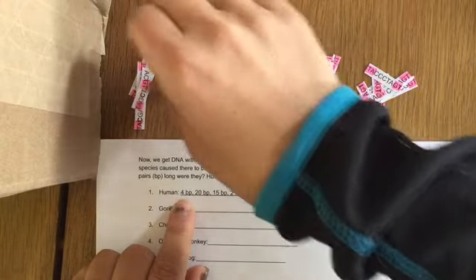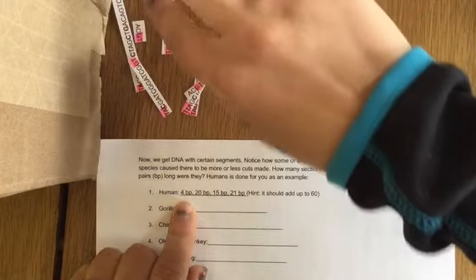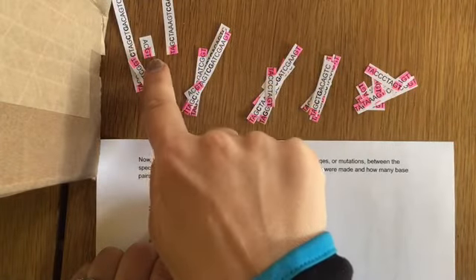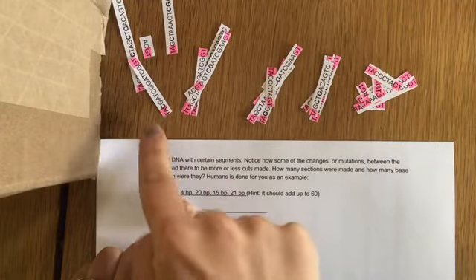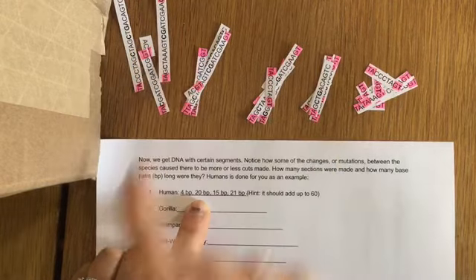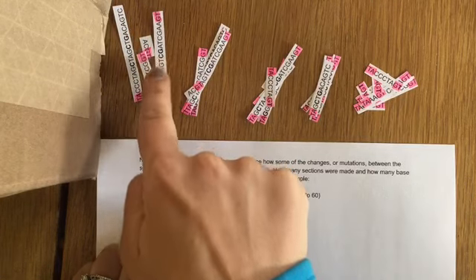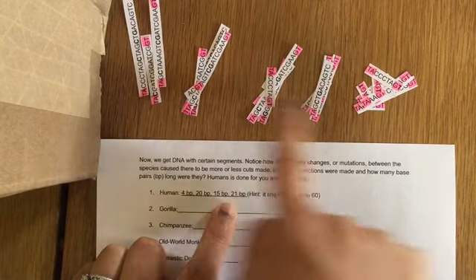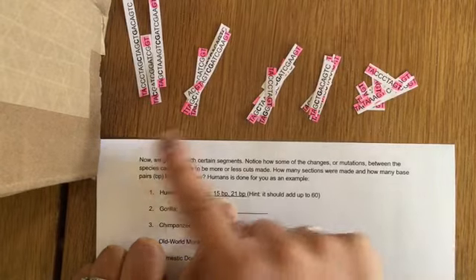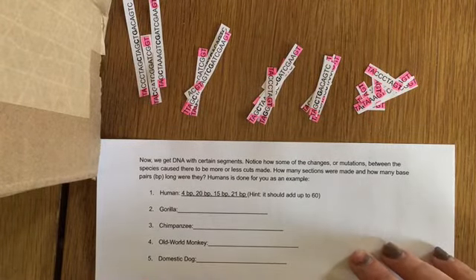So if we look at the human, we have one segment that is 4 base pairs long. We have one segment that's 15 base pairs long, one that's 20 base pairs long, and one that's 21 base pairs long. So what you can do is go through and figure out how many base pairs long each of these segments are. So now, what do we do with this information?